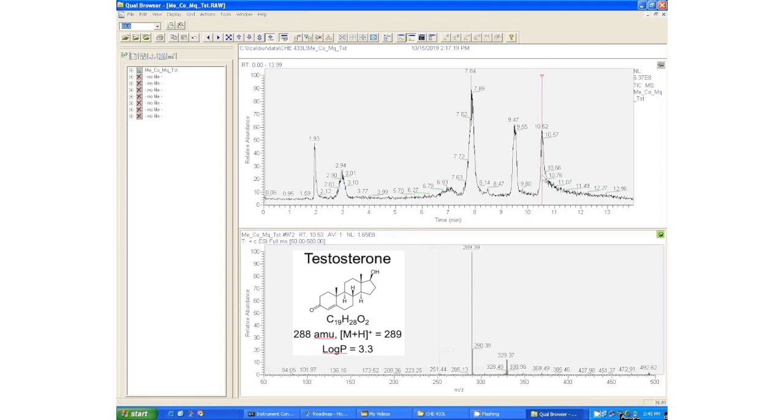An interesting thing about testosterone though is it's a good illustration of how you don't need an amine to be protonated and as a gas phase ion in electrospray. You can see that testosterone has no amine, and if we were in solution, if you were being asked an exam question on sample prep or acids and bases or something, it wouldn't be a good answer to say oh I expect testosterone to accept a proton. But in the gas phase in an electrospray source, testosterone accepts a proton just fine and becomes the M+H protonated molecule.